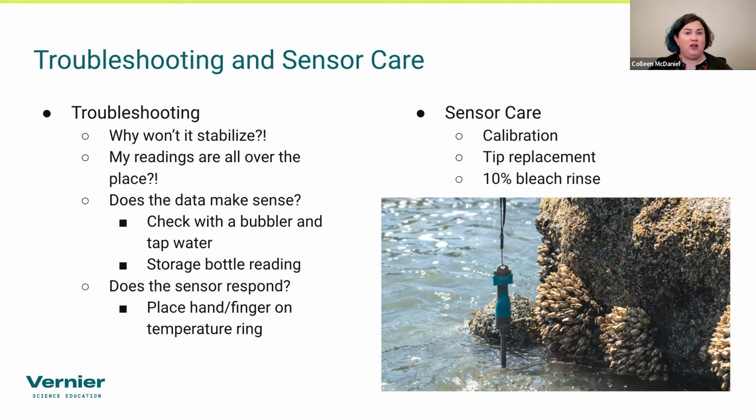But honestly, if the light is affecting the readings, it's very obvious. It's not a subtle change. It's quite literally we see a spike come up and then come down. And that's where we find that worrisome part.